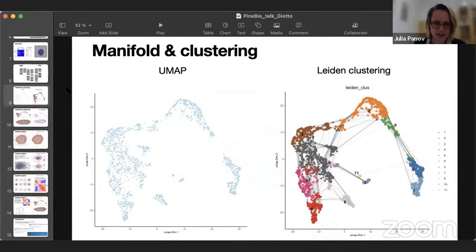And to add a little bit to that, a lot of people ask us if now we have this technology that allows us to do single cell, will bulk RNA-seq be obsolete? And the answer is probably not. There are more and more computational ways of combining single cell data, which is very sparse. So you have a lot of genes that appear to be not expressed at all, but in reality, they are expressed.